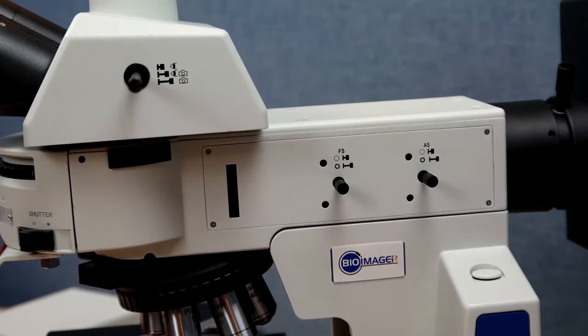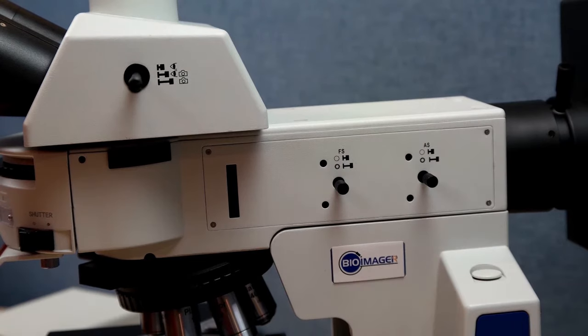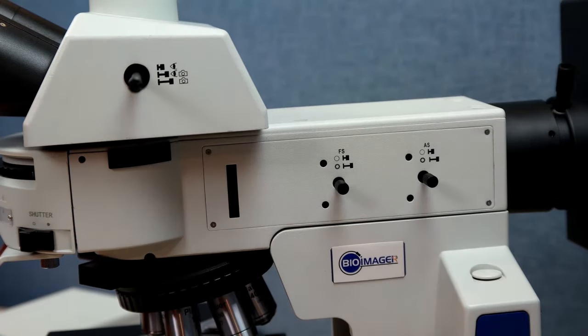To use this microscope for different imaging modes, you can get an epi-white attachment that is mainly used for industrial or metallurgical applications. That package includes a 100 watt halogen, and you can use this system for bright field, dark field, polarization, and DIC imaging modes.